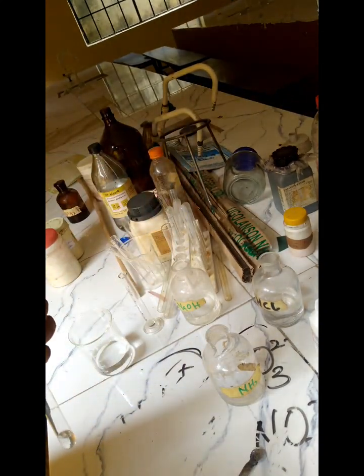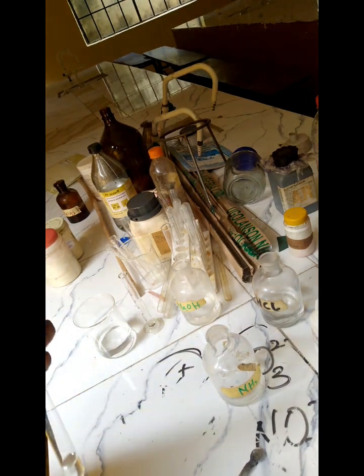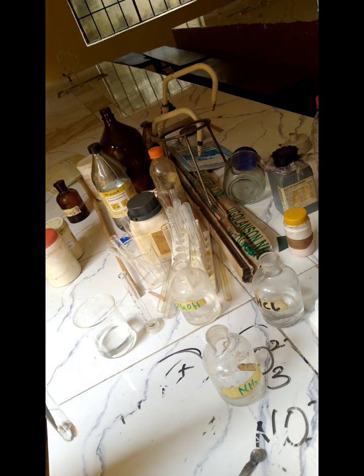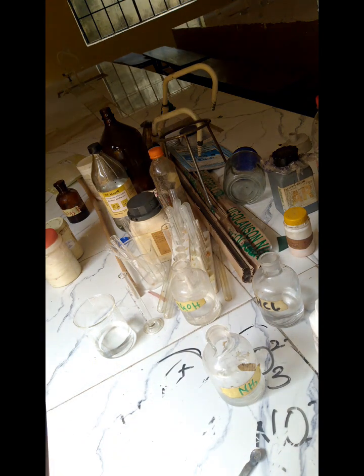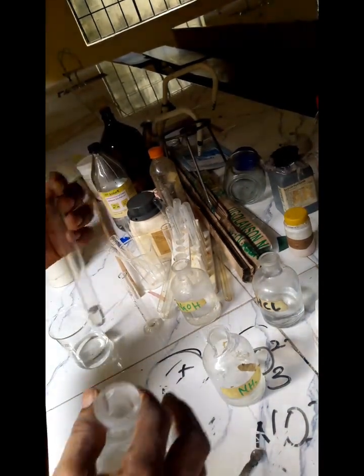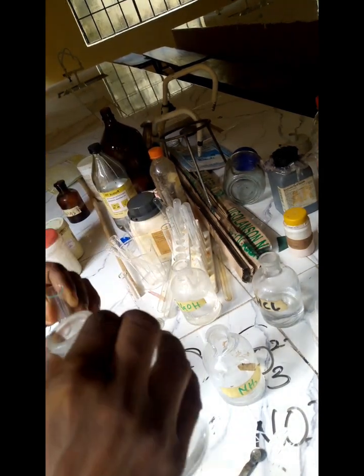Let's now add barium chloride. If we add barium chloride, we're supposed to get a white precipitate. Let's add barium chloride to this sample. Here is our barium chloride solution. Let's add it. It's supposed to give a white precipitate.